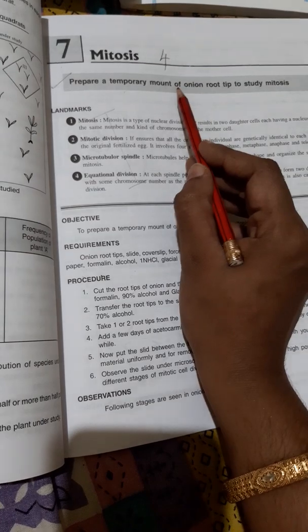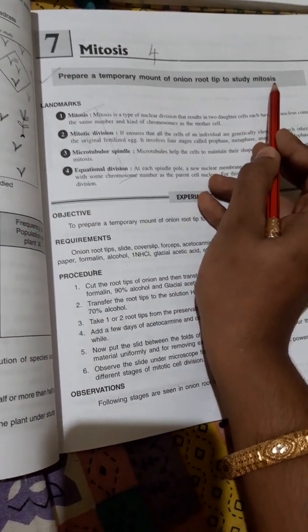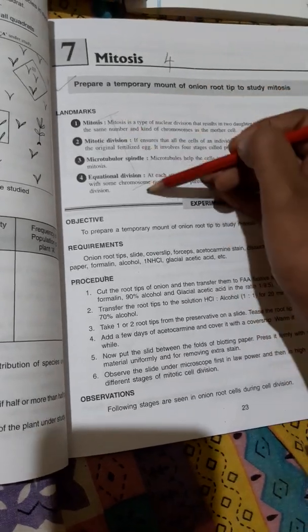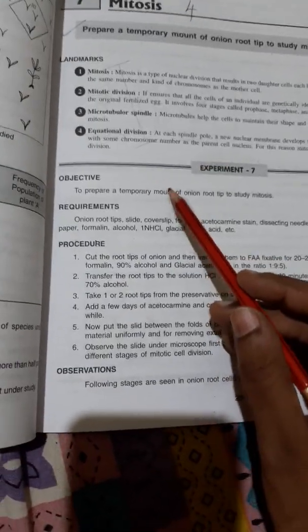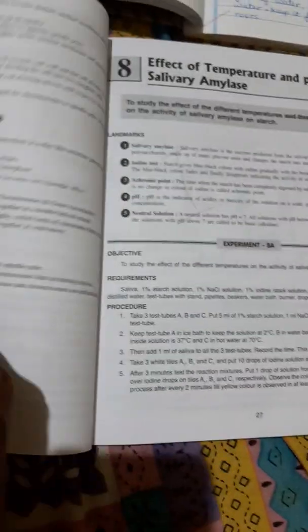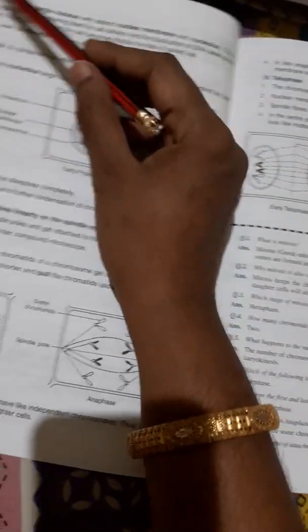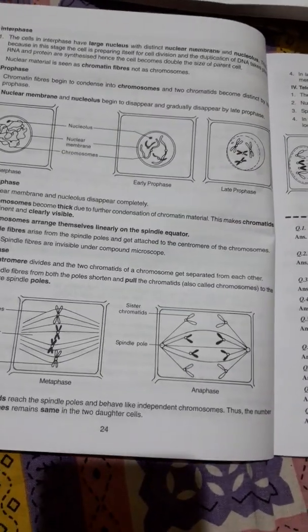Prepare a temporary mount of onion root tip to study mitosis. That is the heading. Okay. Then leave these landmarks. No need to write these landmarks. Then write the objective, requirements, procedure, observations, then interphase, prophase, metaphase, anaphase, telophase. You have to write all these notes and these diagrams on the left side.